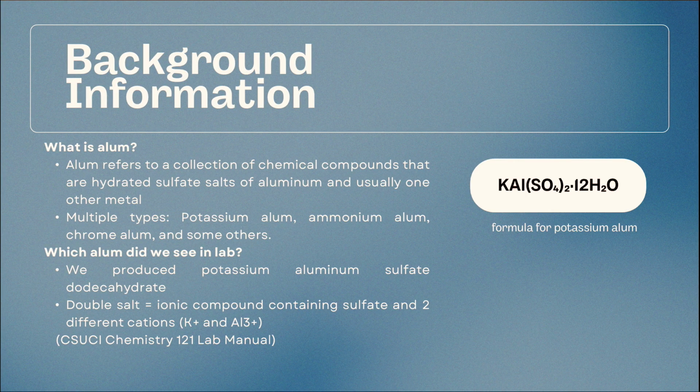Speaking of those water molecules, this brings us to an important concept: hydrates. The 12H2O in our alum's formula tells us that for every unit of salt, there are 12 water molecules incorporated into the crystal structure. These water molecules are essential to the crystal's structure and properties.